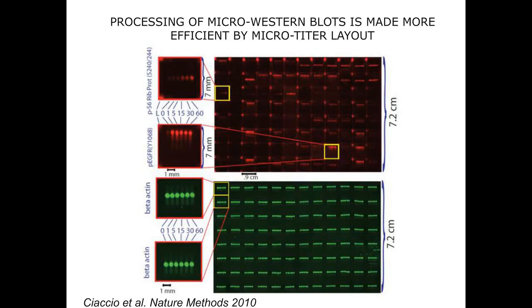And I show here the phosphorylation kinetics of S6 ribosomal protein at the top left, which undergoes very slow increases in modification after growth factor stimulation, versus the epidermal growth factor receptor itself below, which shows very rapid phosphorylation kinetics within a minute of stimulation.